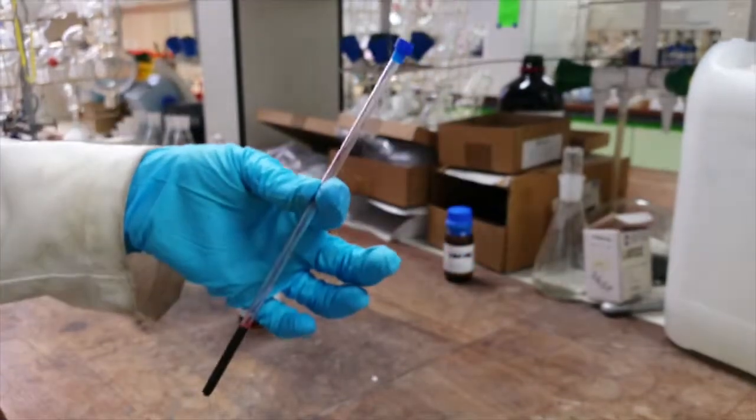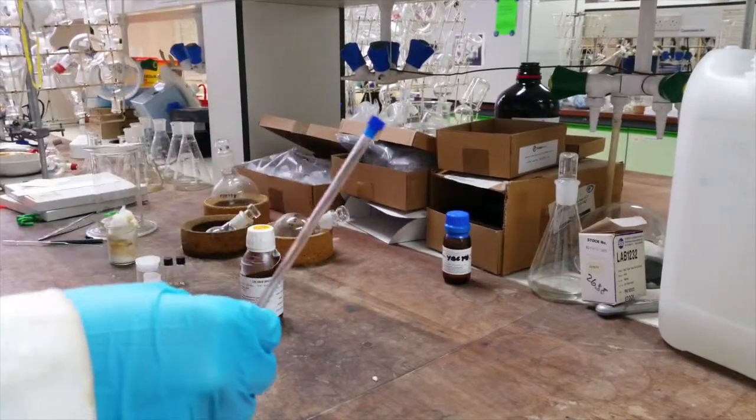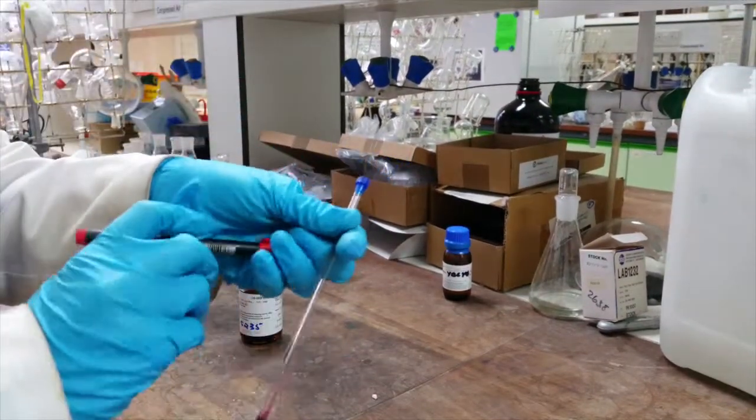Put the lid on the NMR tube and write your name and the sample code clearly at the top of the NMR tube.